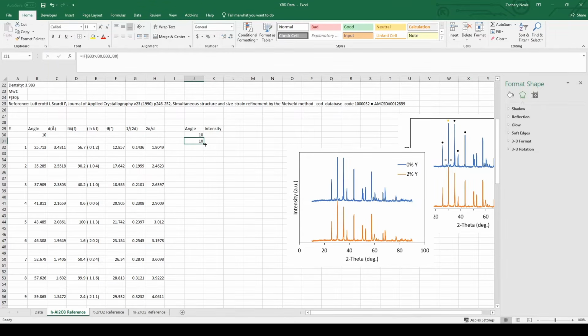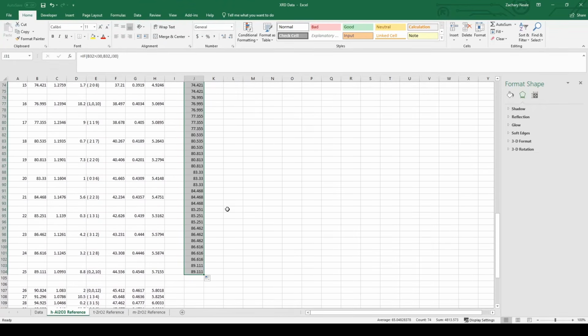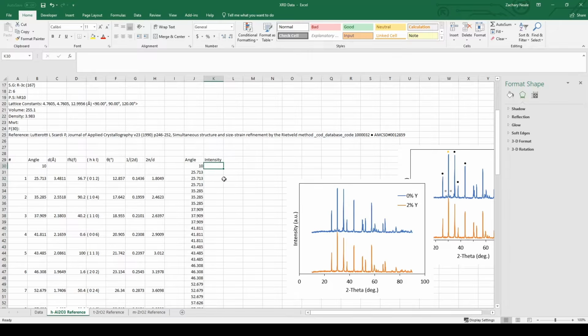That didn't work. Why didn't that work? Oh, excuse me. This is why it didn't work. Okay, and then intensity is just the same, like that.